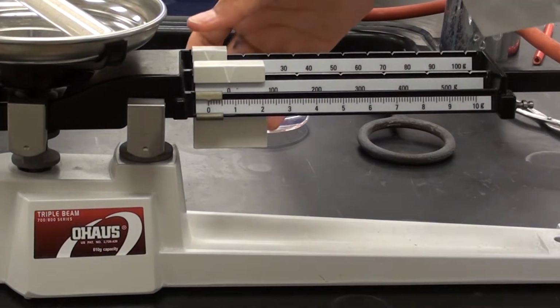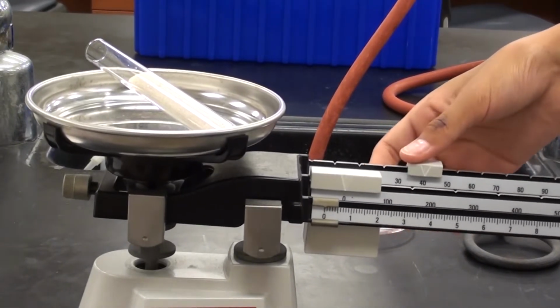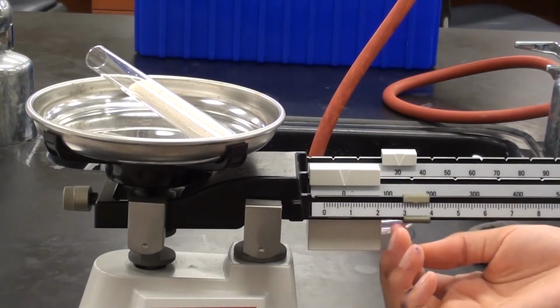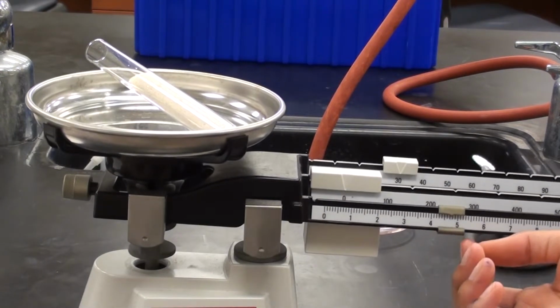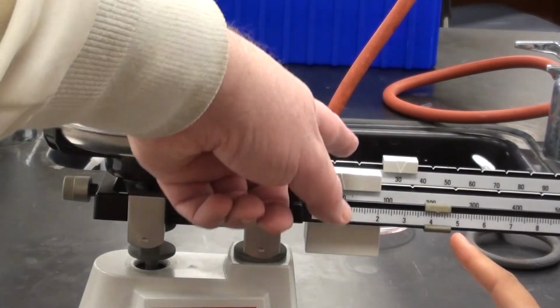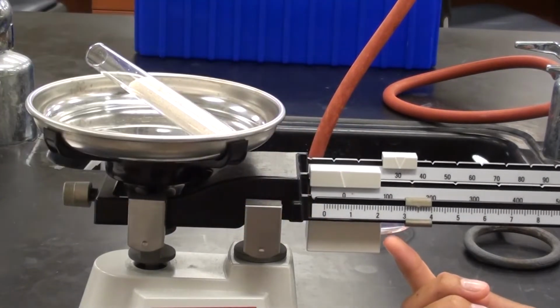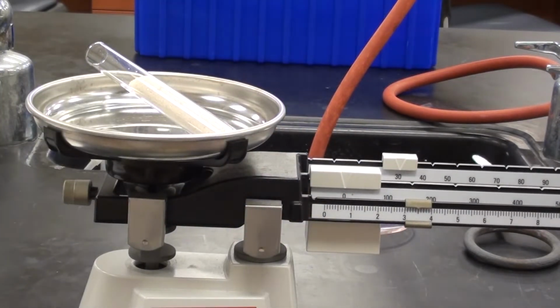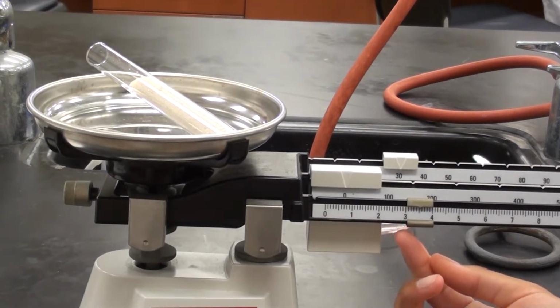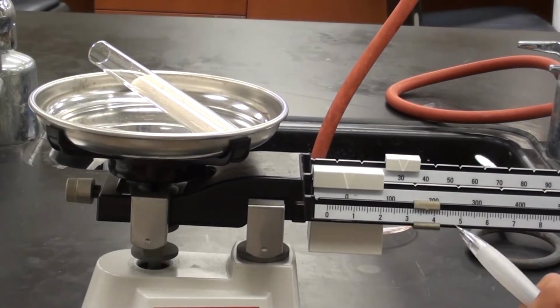You'll notice that the sand doesn't come out of the test tube. Even if it was flat, it wouldn't come out. And what she's doing now is weighing using a triple beam balance. The best technique with a triple beam balance is to make sure, as Sabrine has done, that everything is in the appropriate notch. This one doesn't have notches, of course, but this one has a notch and this one has a notch, and she has it in the notch there. So she's weighing the tube with the sand and salt mixture in it right now. She's doing it to 2 decimal places.